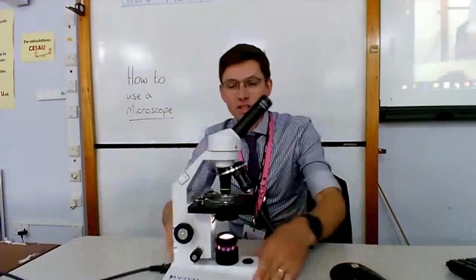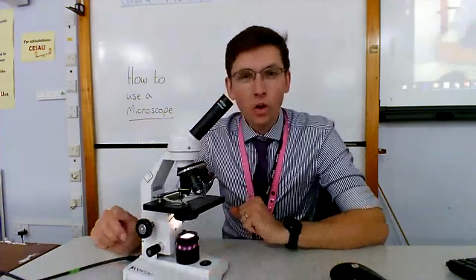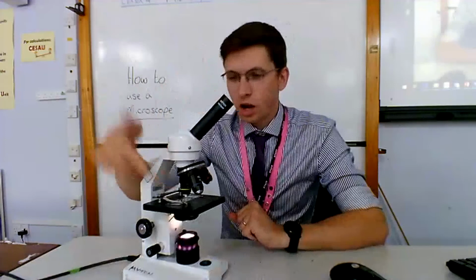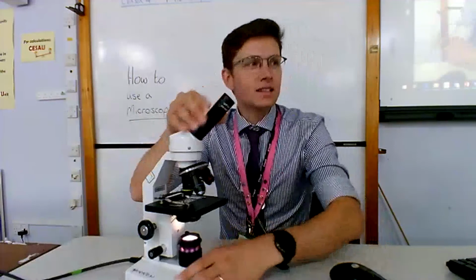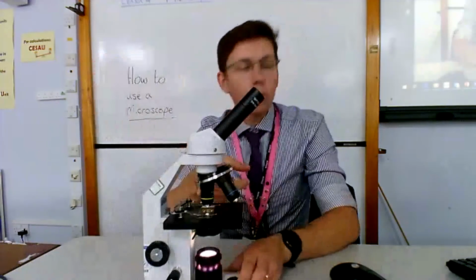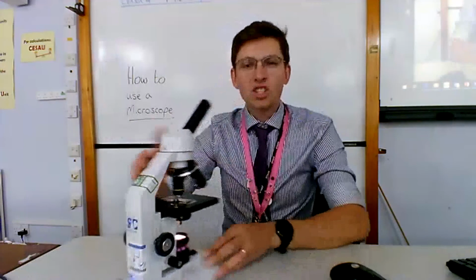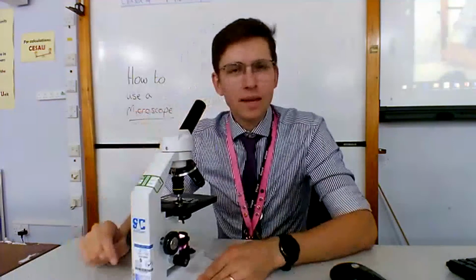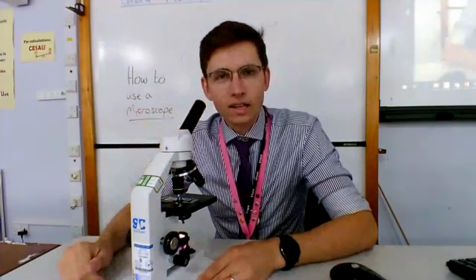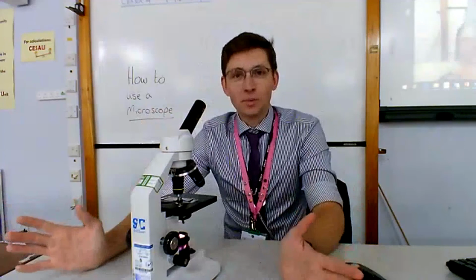The last thing is to work out our total magnification. And all we do is we times the numbers on both of our lenses together. So here it says times 10, that little bit there that I've left uncovered. So this eyepiece lens magnifies everything 10 times, and the yellow one is also 10 times. So my total magnification is 10 times 10, which is 100. So what I'm seeing here is 100 times bigger than is actually on the stage. And that is how we use a microscope.